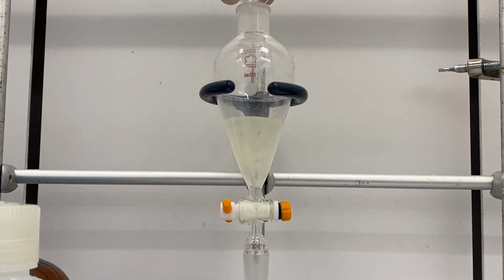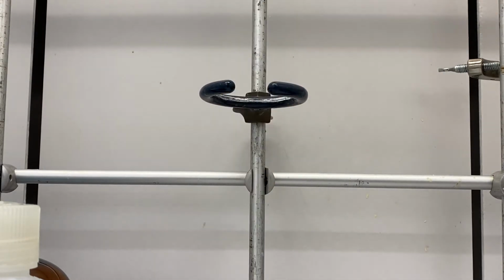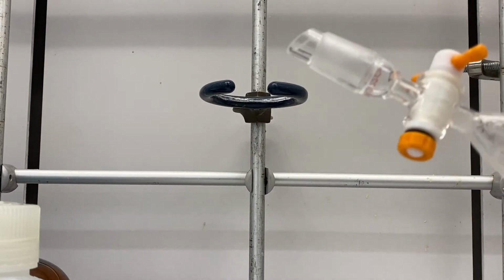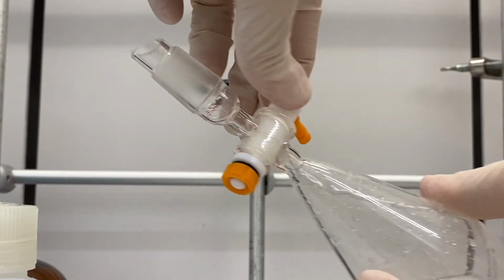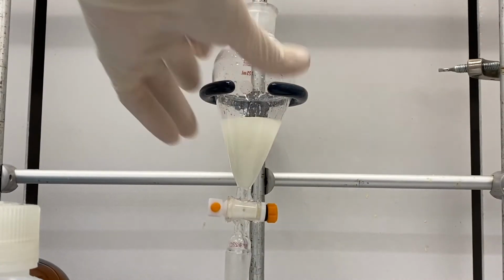You can see the two layers are forming. So I'm going to cap it, shake it, vent, let those layers separate.